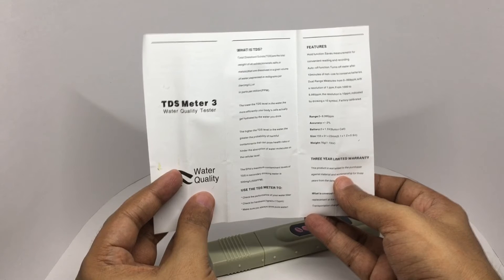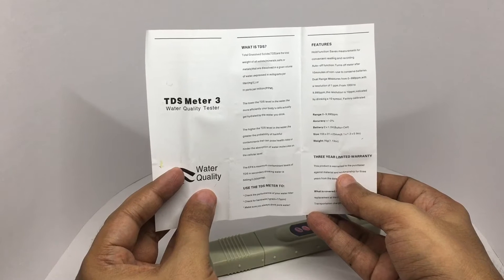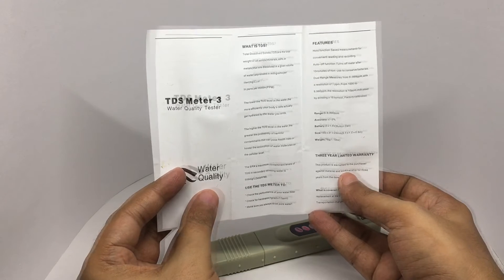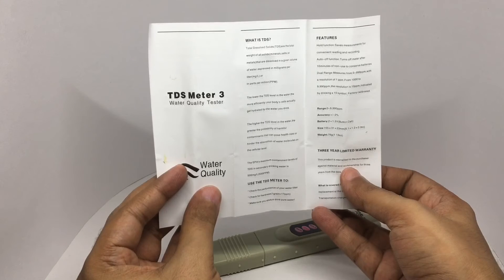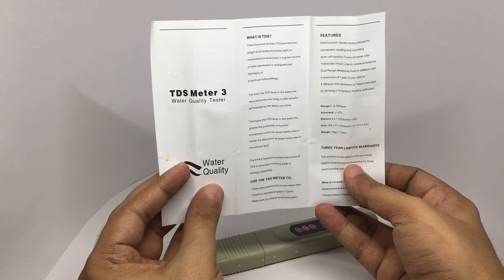TDS is expressed in milligrams per liter or parts per million. The lower the TDS level in the water, the more effectively your body cells get hydrated by the water you drink. The higher the TDS level, the greater the probability of harmful contaminants that can pose health risks or hinder absorption of water molecules at the cellular level.